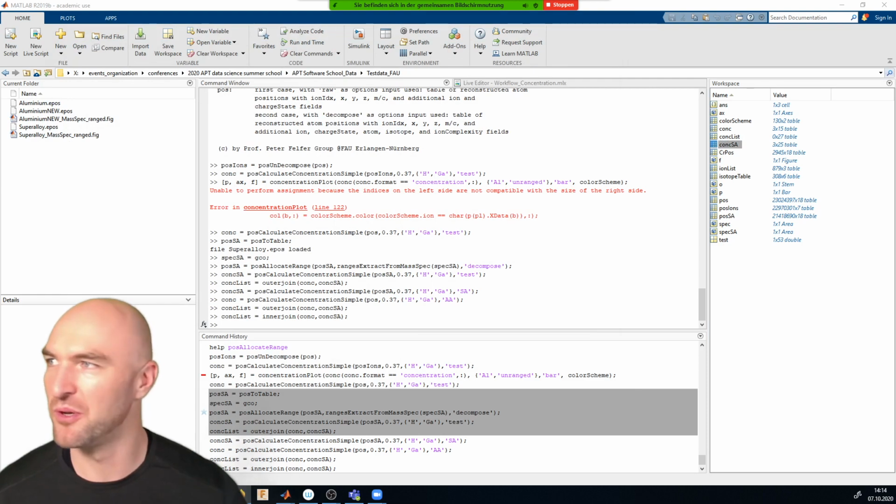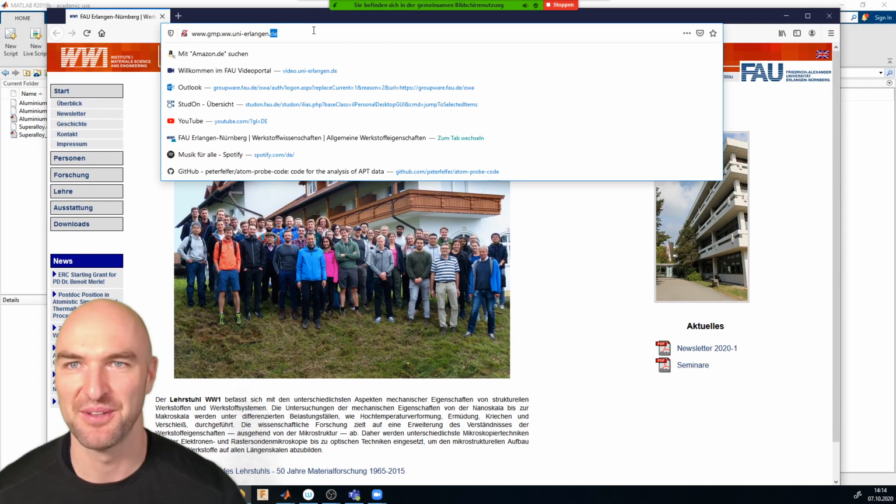Okay, and now we all learn troubleshooting on the fly.